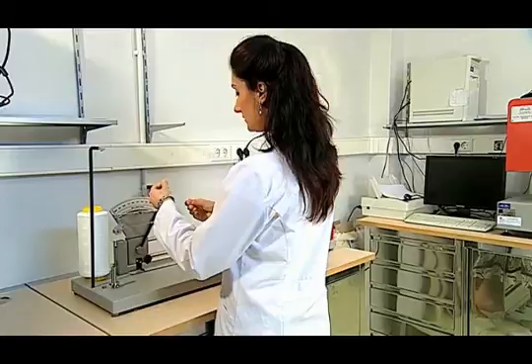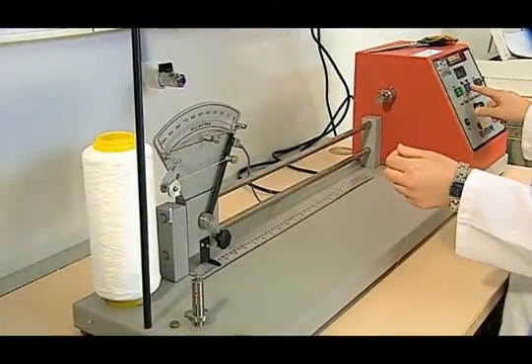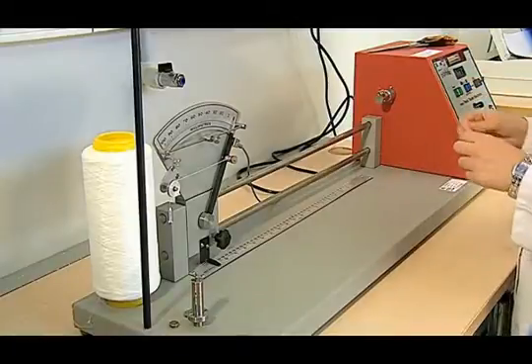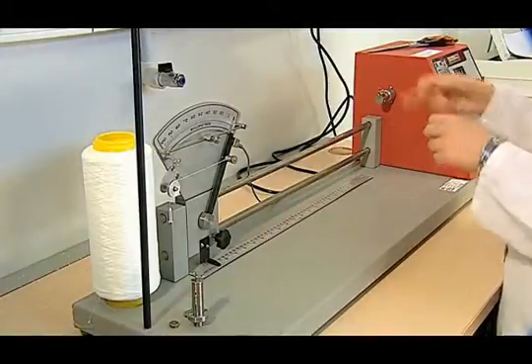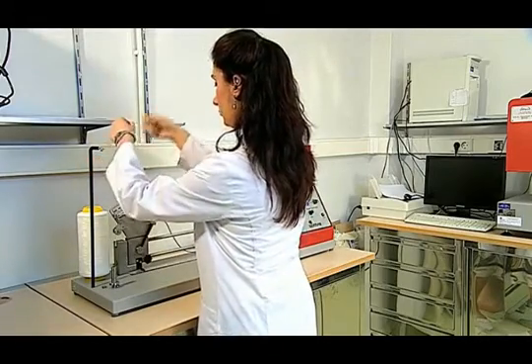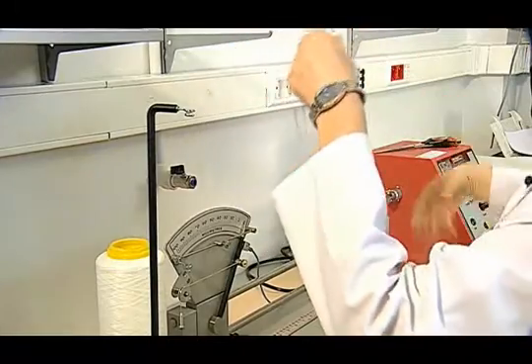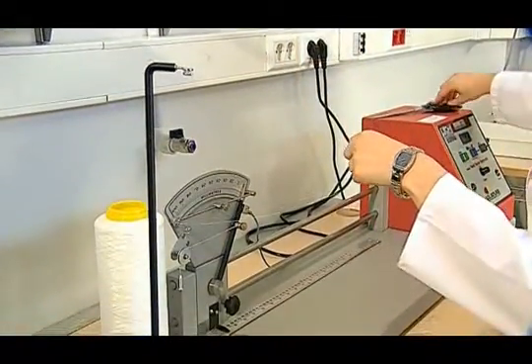Bu testimiz için büküm yönünü tayin ediyoruz ve cihazımıza bunu seçiyoruz. Daha sonra yaklaşık 5 metre kadar ipliğimizi bobinden çekip makas yardımıyla kesiyoruz.